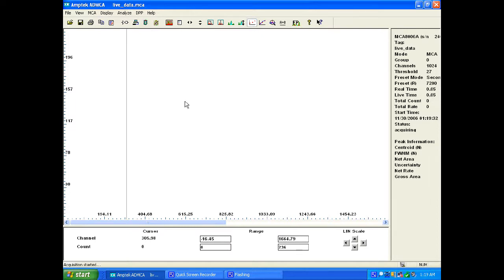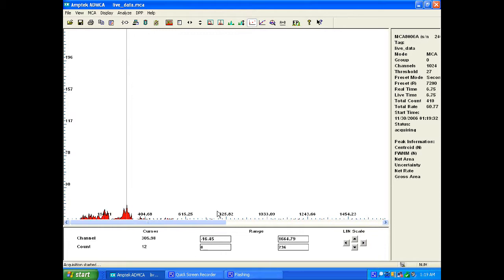And here we go. So here's the acquisition in progress. I already have it calibrated.